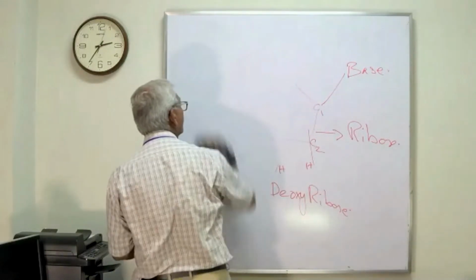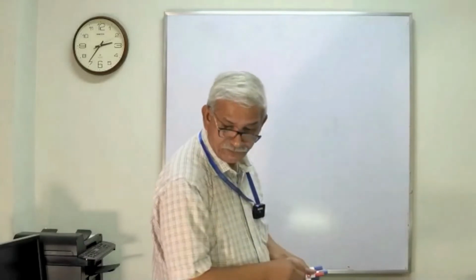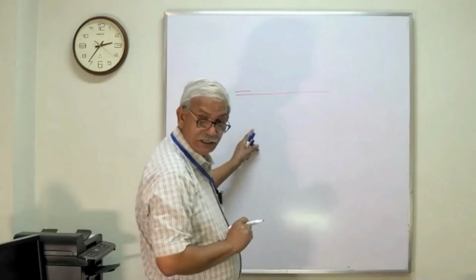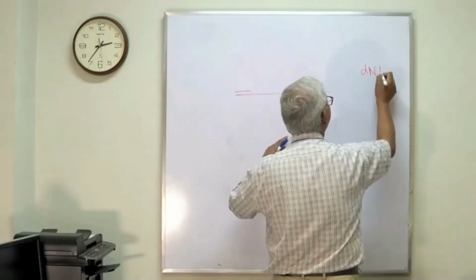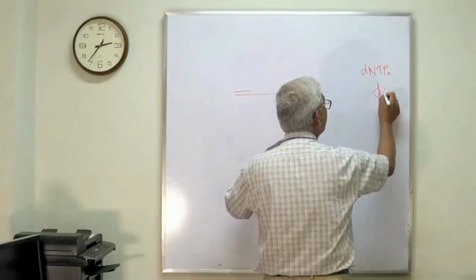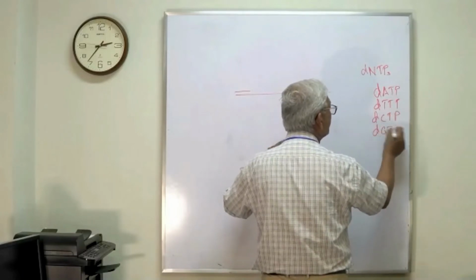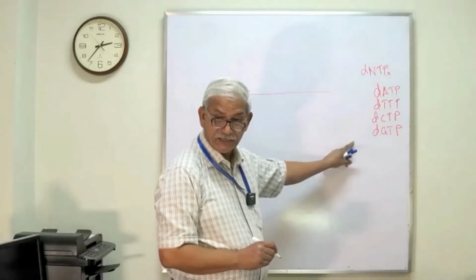We already know that it has 5 components. We have a single-stranded DNA, and the primer is bound here. In the 5 component system, one of the components is deoxy NTPs, dNTPs. The dNTPs are deoxy ATP, deoxy TTP, deoxy CTP, and deoxy GTP. These are the 4 different nucleotides.